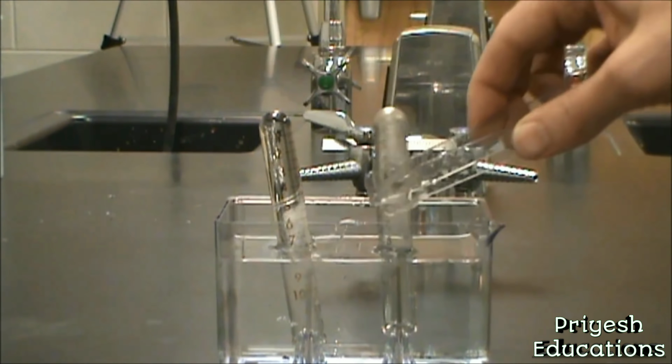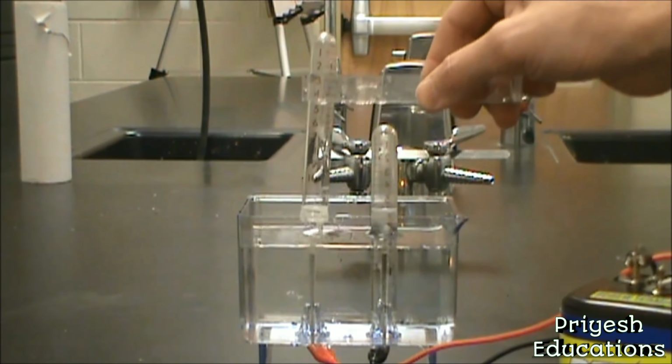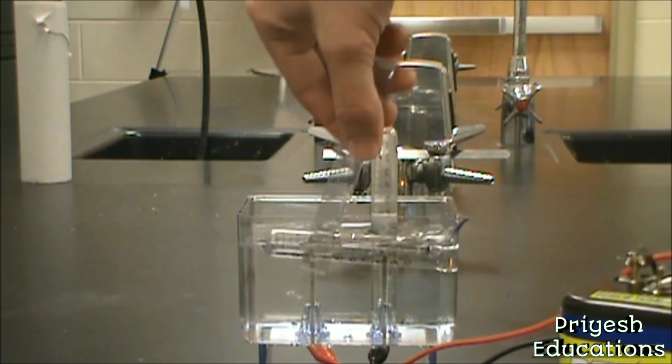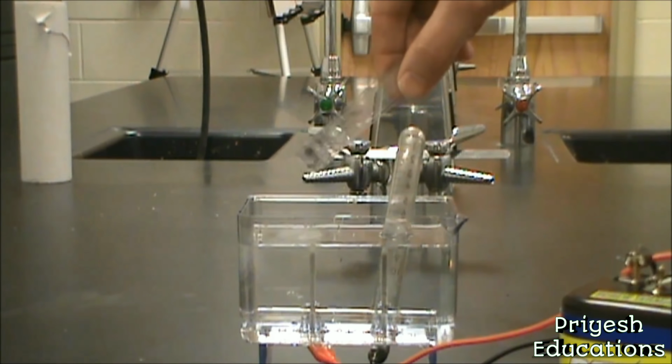Because those last couple didn't work out quite so well, I'm going to run this one more time with the flame test. So this has now been filled all the way. And we're going to take this one. This one is the one that is completely filled up. And there's our successful hydrogen test. Okay. And the other one was not able to fill up all the way because when the test tube here is filled with hydrogen gas, the electrolyte is no longer in contact with the electrode.